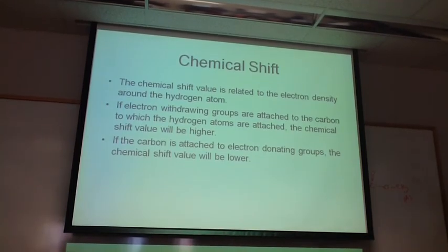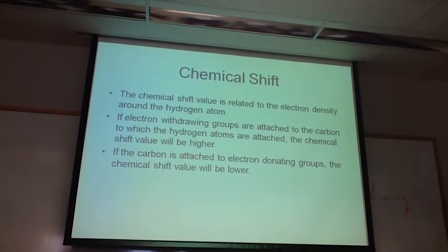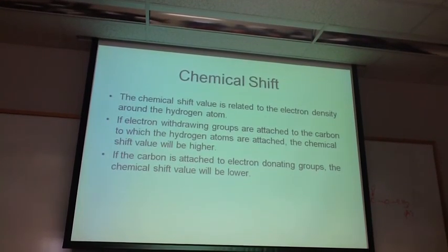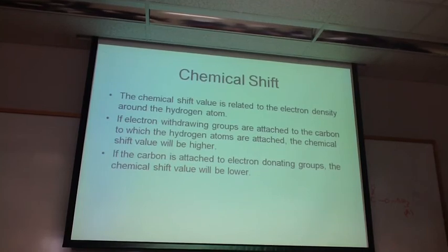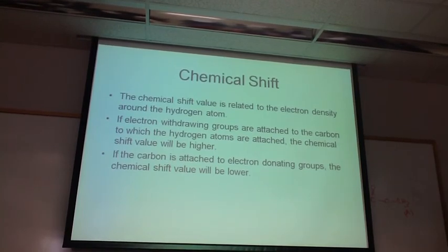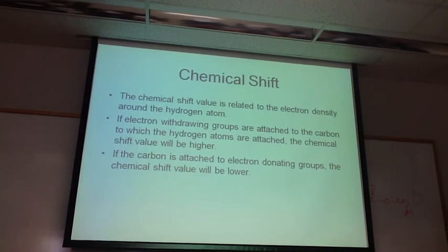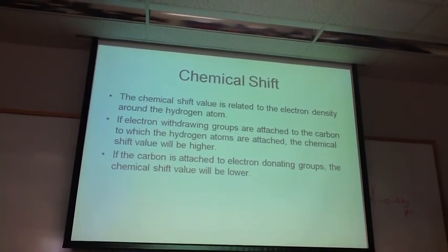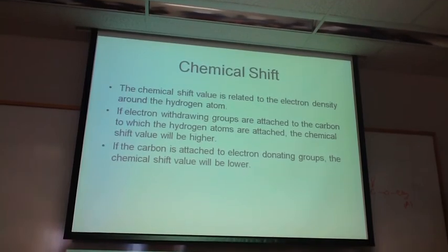Yep. Okay. And so, give me examples of electron donating groups. Cations, sodium. Not metals. Not metals. So CH3 groups are known to be electron donating. Okay, so anything CH3 will come in around 1. Anything with a hydrogen on it.